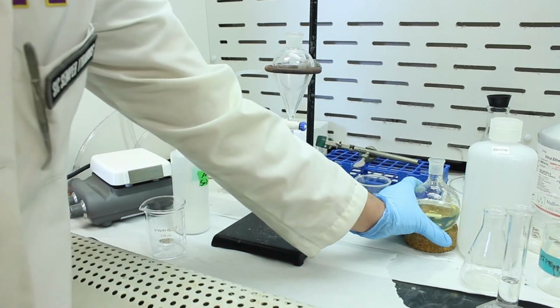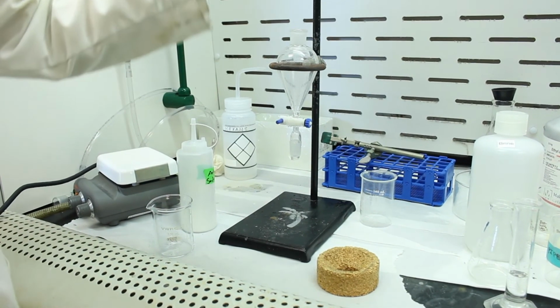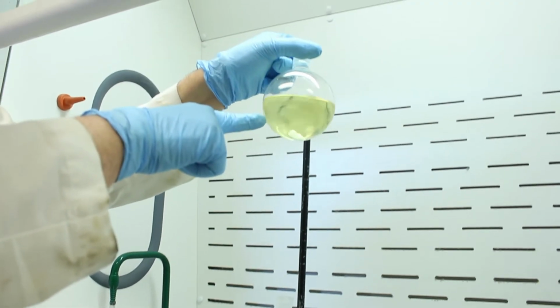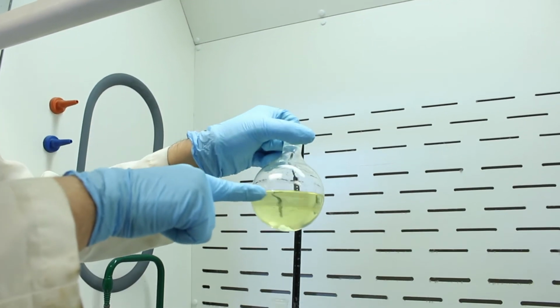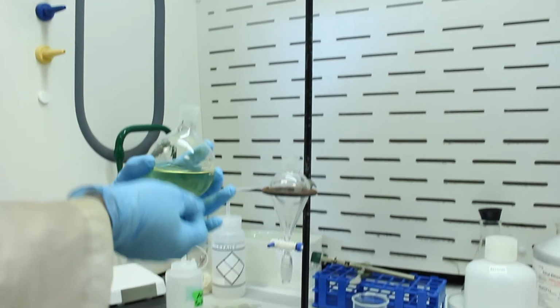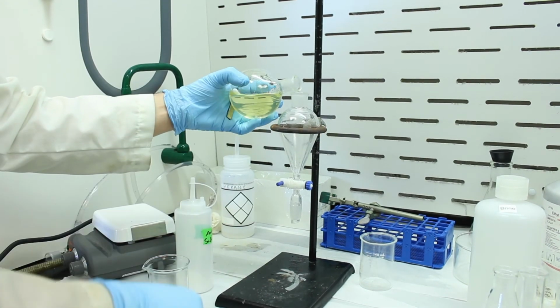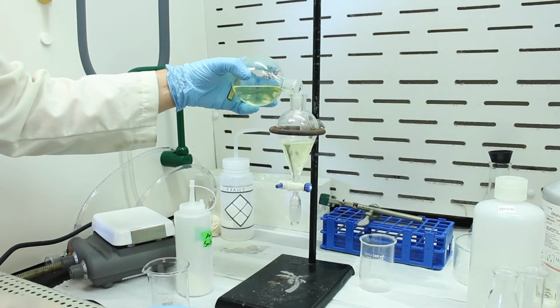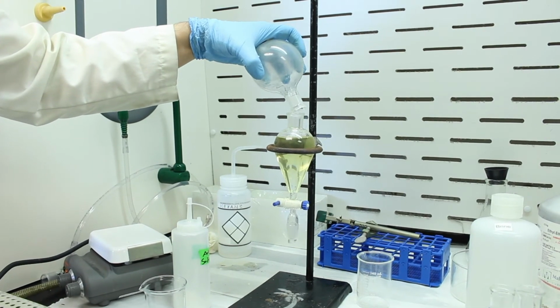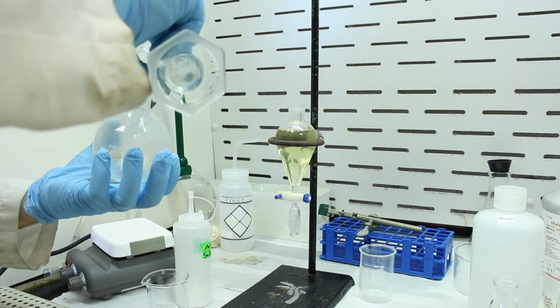Okay, so we have our mixture here. We've disassembled the apparatus. We have our biphasic mixture. It's a little hard to tell, but the lower phase is water, and the upper phase is ether. Okay, so we're going to take it and pour it into this sep funnel here to separate the layers. Okay, I use a little ether to rinse out the flask.